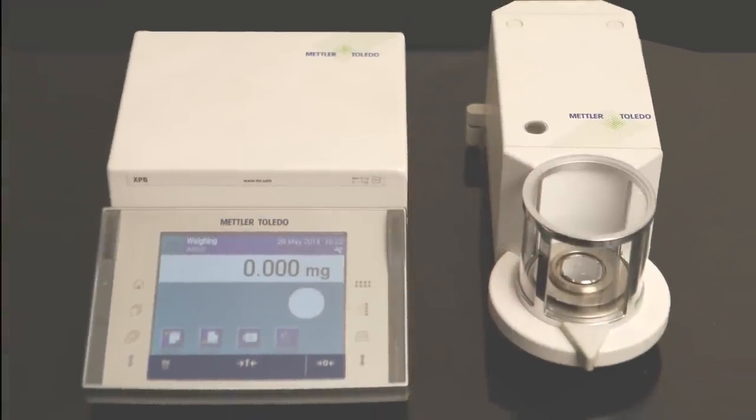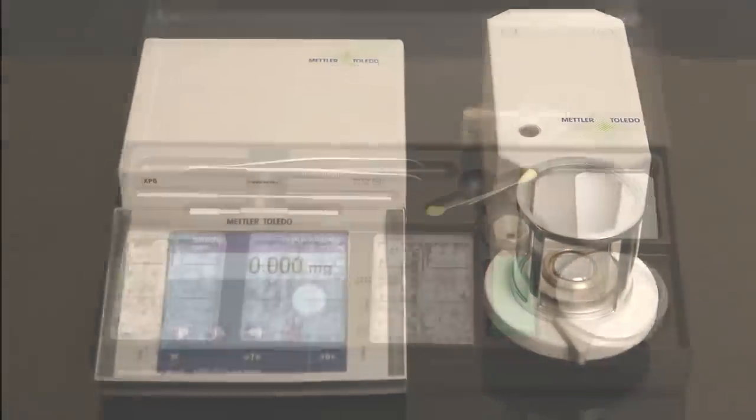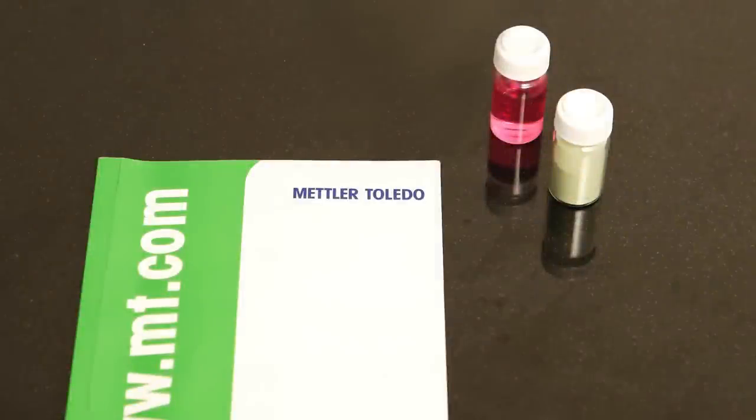For DSC sample preparation you need a microbalance placed on a stone table, the crucible box with crucibles, a crucible sealing press, a lab journal, and of course the samples.